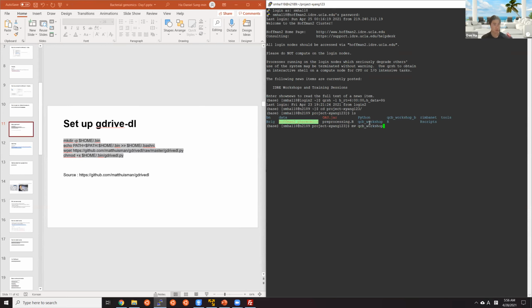Let's make a directory, mkdir qcb workshop, and let's try to download some data from.